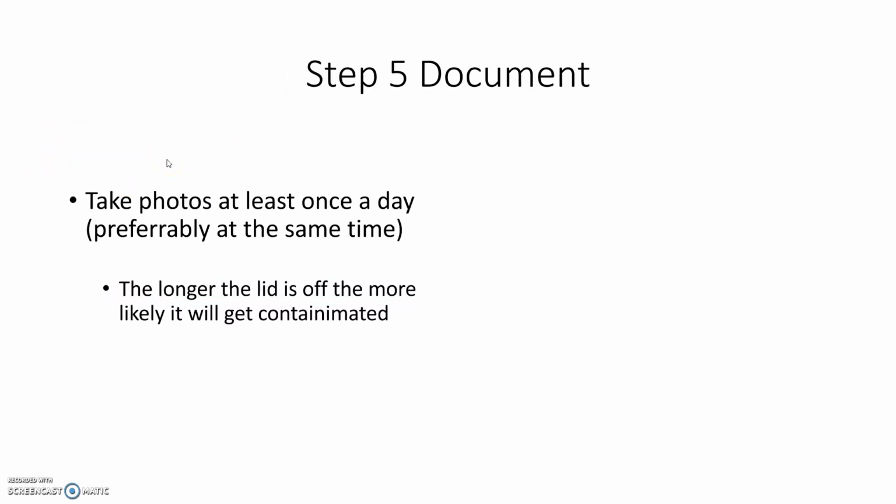And then you're going to document it. You're going to take photos, I would say at least once a day. I took them once, sometimes twice a day. Hopefully at the same time, so same time of day, and at the same time, all 3 of them. Do keep in mind that you want to do that as quick as possible, as to not contaminate it with some sort of fungus that's growing around. But it'll happen. But take photos.